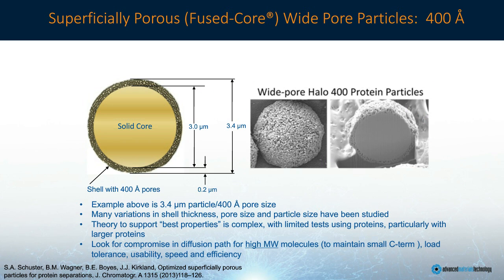So around 2013, Advanced Materials came out with a wide pore, 400 angstrom, 3.4 micron particle. So this is a substantially large solid core relative to the surface shell.